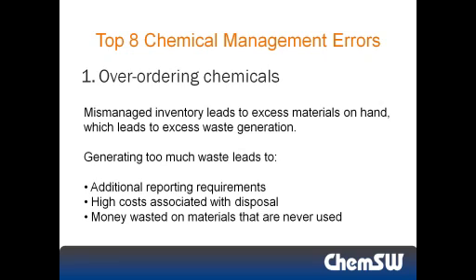When many different people are using these materials, if the laboratory doesn't track the usage in real time and provide real-time visibility, people may think that they're out of the material and just get more on order. People will also reorder what they can't find. We know that to be true, driving up chemical procurement and waste costs.